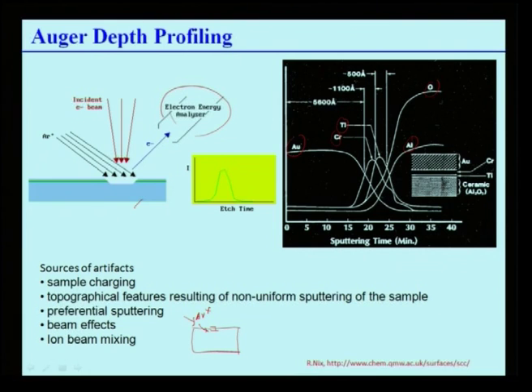Okay, this is basically a gold layer on the top, aluminium oxide at the bottom, and an interlayer between the gold and the aluminium oxide. The interlayer consists of chromium and titanium. That's what you see here: the concentration of chromium and titanium is very high in the intermediate zone. Gold concentration was high at the beginning, from 0 to about 20 minutes, then it decreases. Finally, once you reach the aluminium oxide layer, you have aluminium and oxygen.